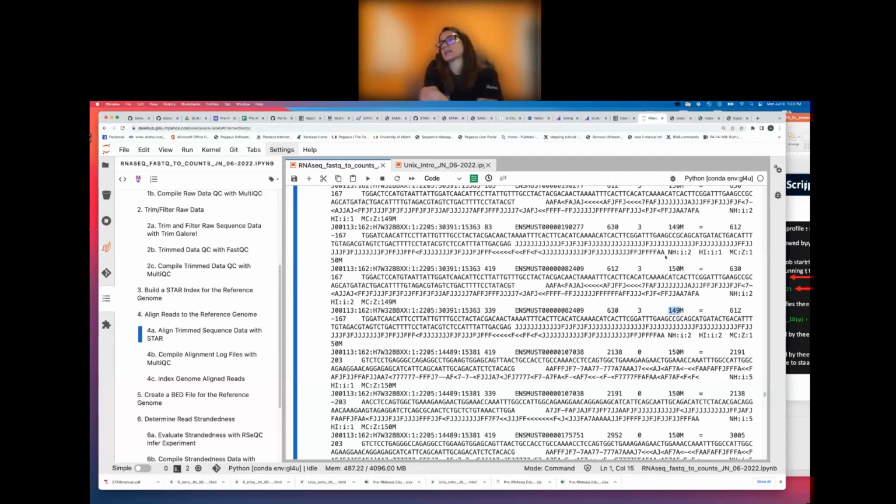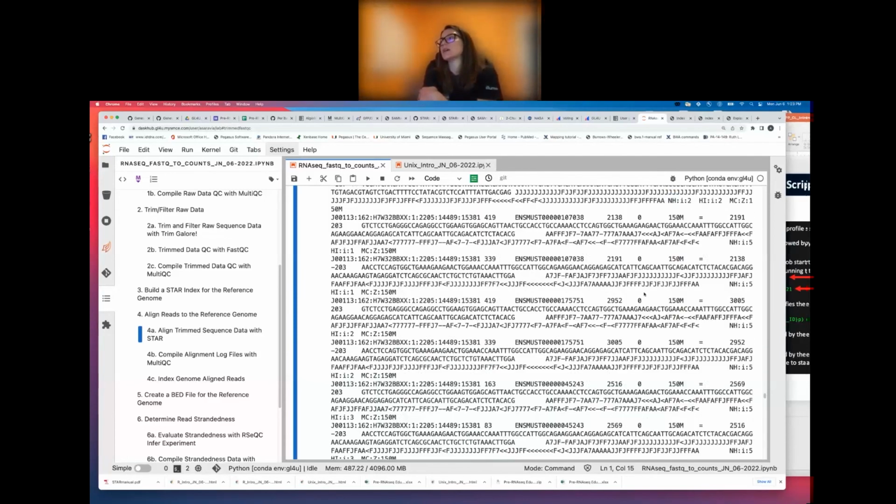So that makes sense of why the mapping quality is the same. And you see the same for this next mate pair too. Both reads in this next mate pair are 150 base pairs long. The forward read is 150 and the reverse read is 150. I know that it's 150 because the max that it could be is 150. If this number is 150, then nothing was trimmed from it. And M means that all of them were matching. If this only had 140 of 150 matched, it would say 140 would be matching.